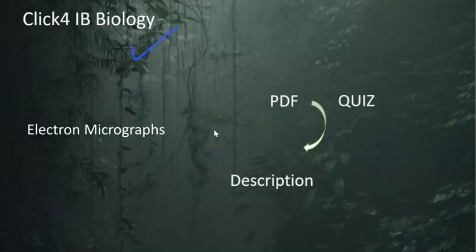Click for IB Biology. Here we're looking at the use of electron microscopes to produce electron micrographs.